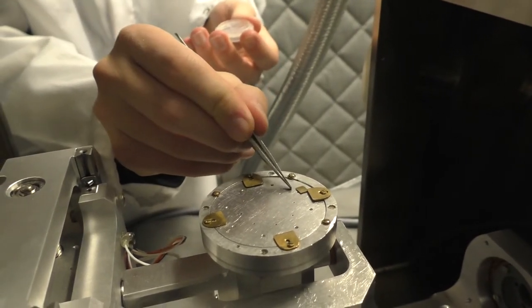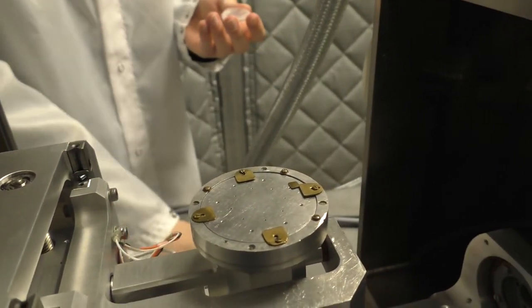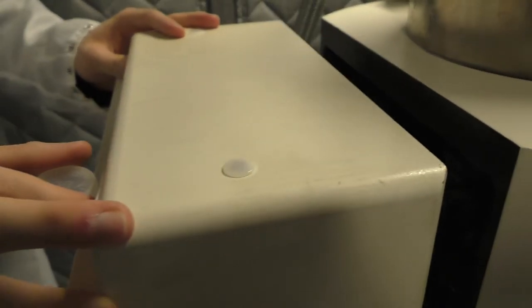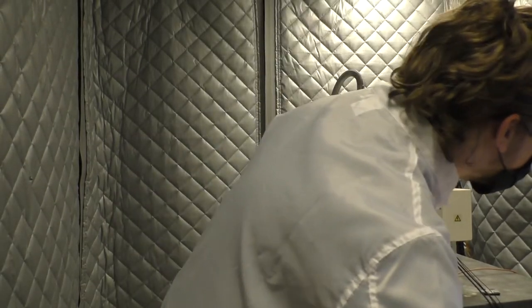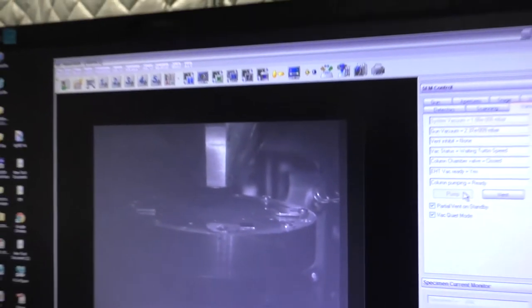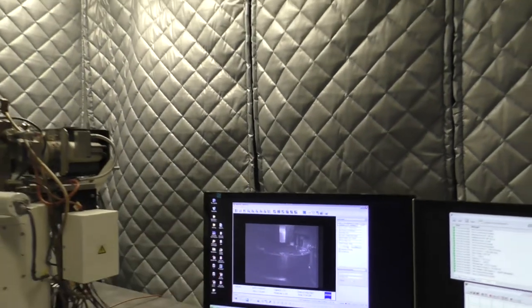The vacuum environment allows the electron beam to travel without scattering with air molecules. Once the sample chamber is in a high vacuum, we turn on a high voltage. This accelerates the electron beam to the sample.